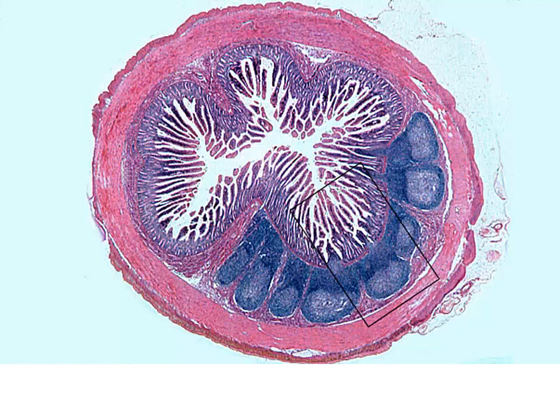Here's another view of ileum. We can't quite see the thin, drawn-out nature to these villi, but we definitely see our Peyer's patches. We can see some plicae circulares. Again, we know we're in intestine. We know we're in small intestine because of the villi, and because of the secondary lymphoid nodules, we know we're in ileum.